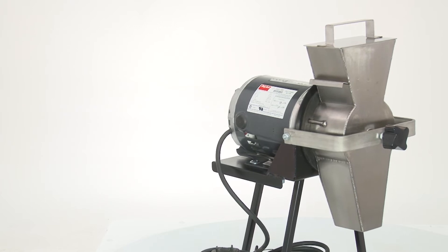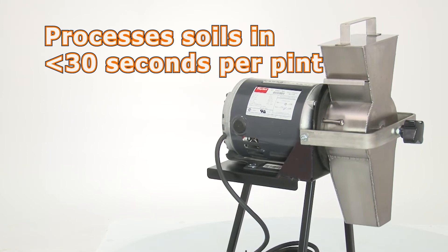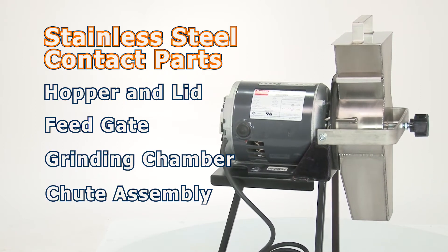The Gilson Soil Grinder processes most soils in less than 30 seconds per pint. The SA45's stainless steel contact parts reduce contamination between testing different samples.